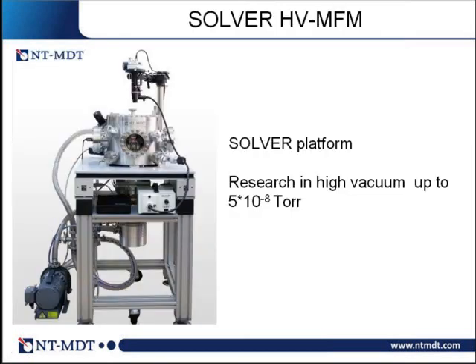What is, however, important is that if one needs to investigate samples at low temperatures, you need to have high vacuum, because otherwise, even with this low vacuum, the moisture which you definitely have in your system will disturb the interface surface of your sample, and definitely disturb the signal which you obtain from MFM.